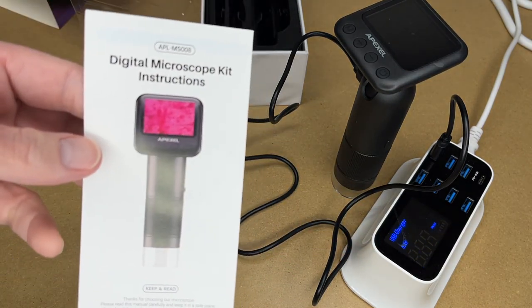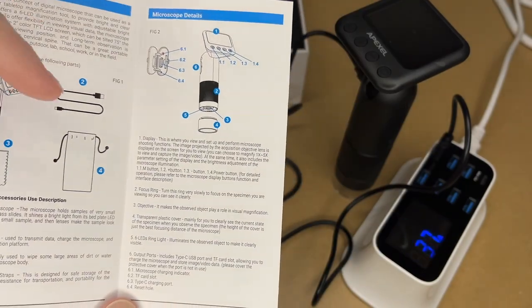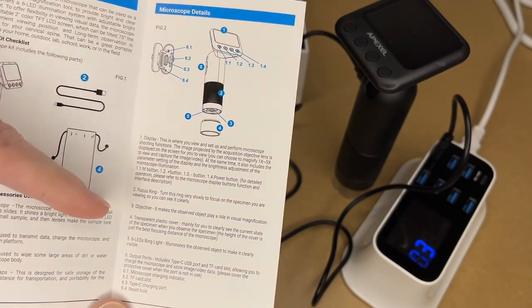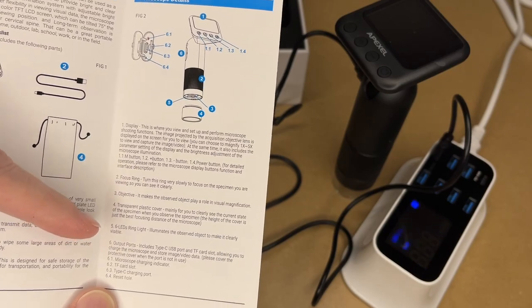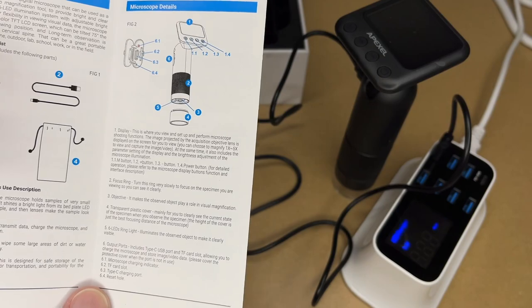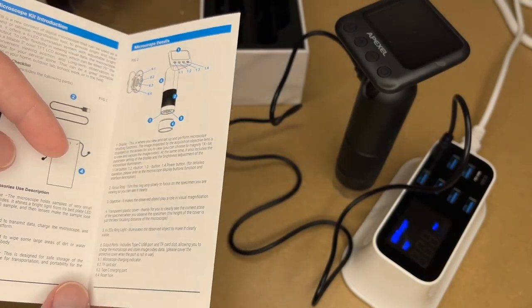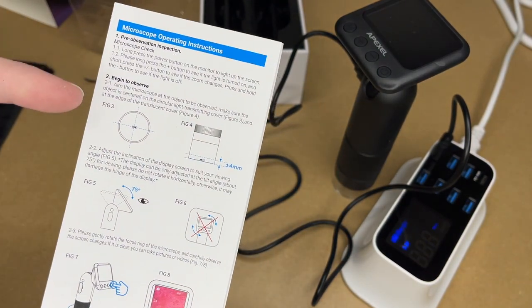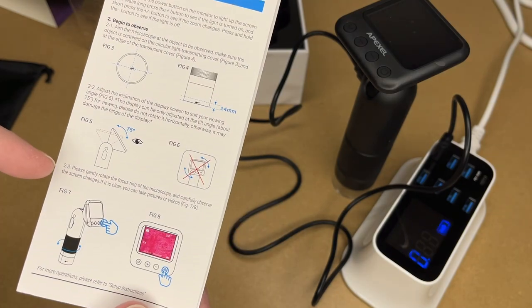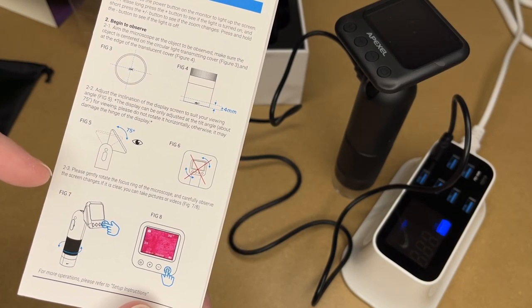Let's take a look at the manual. It has an introduction and talks about the different parts. We have the display, the M button, the plus/minus button, the power button, a focus ring, objective, transparent plastic cover, six LED ring lights, and output ports. This has a TF or micro SD card slot, and you can also connect this to a computer using the USB cable. To use it, aim the microscope at the object, adjust the inclination of the display, gently rotate the focus ring, and observe the screen. When it's clear you can take pictures or video.